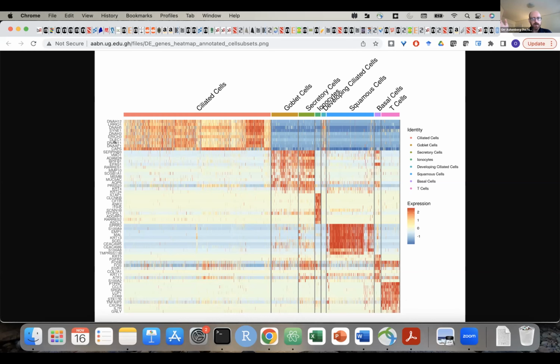Maybe we need to cluster it more or less or try something else. So there's often an iteration between this biological step, where we're trying to interpret what these cell subsets are, and if we're confused or we think something's missing, we go back a step to the clustering or even earlier and change something and rerun through it again and look at how that changes the genes that are being highlighted.